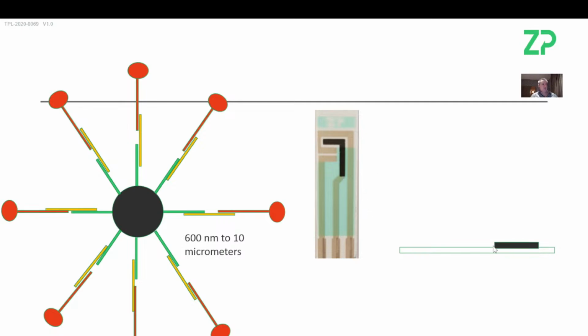I do like the idea that you take the electrodes, you have everything in the bulk, you bring a magnet down, and it brings everything down to the surface. That's literally what I've seen happen, and I think it works quite well. I have seen people then use linear sweep voltammetry. You want to do square wave voltammetry. I agree, square wave voltammetry is a nice sensitive technique. You might as well try differential pulse voltammetry while you're at it.